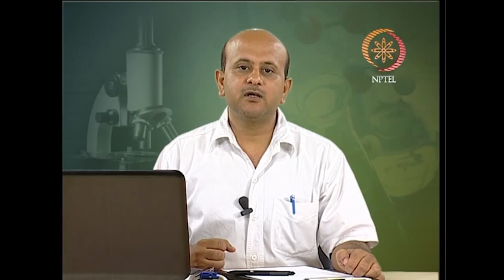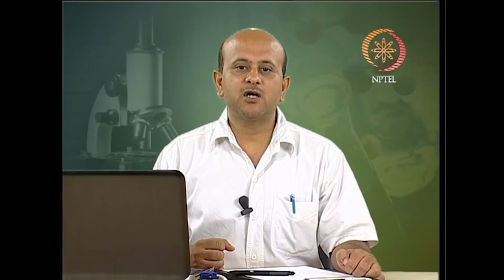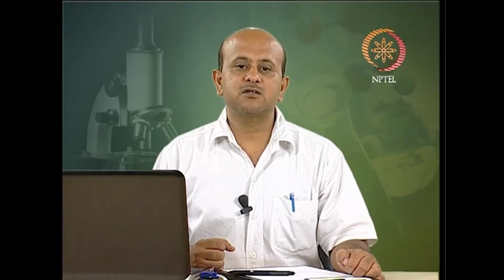Now, once the crystal is in the capillary or loop, this will be mounted on a goniometer head, and this goniometer allows it to be positioned accurately within the X-ray beam and rotated. So, you can position it in front of the beam and properly center your crystal, so that it is in the X-ray direction. Since both the crystal and the beam are often very small, the crystal must be centered within the beam to within 25 micrometer accuracy, and this is aided by cameras and systems available for that.